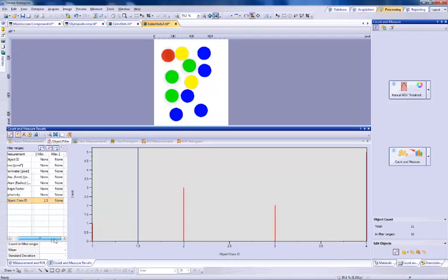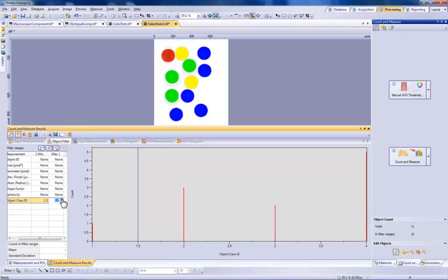We can also see the values in the min/max columns. This is where we can manually enter values. We can double-click on the max value box to make changes to it. By adjusting the value for max to 3.5, we will see the software filter out the 4th class or phase. We can also see the object count has changed from our total of 11 to 5. To clear a filter range, we can simply select the Clear Maximum or Minimum Value icon at the top.